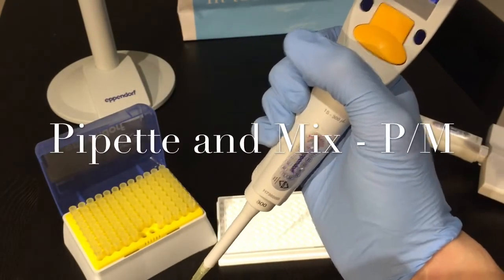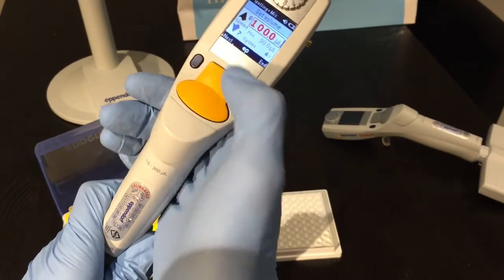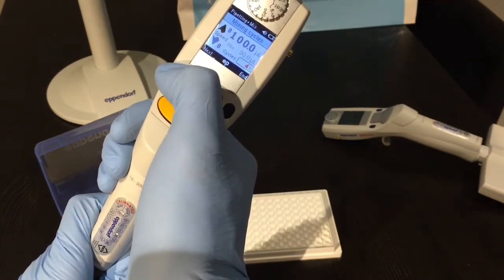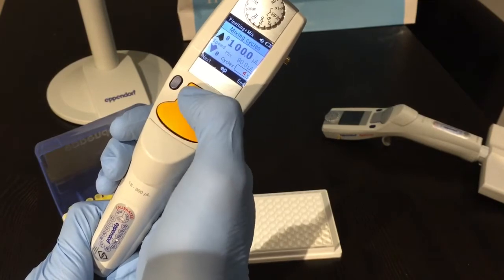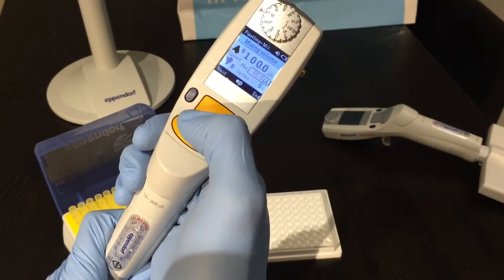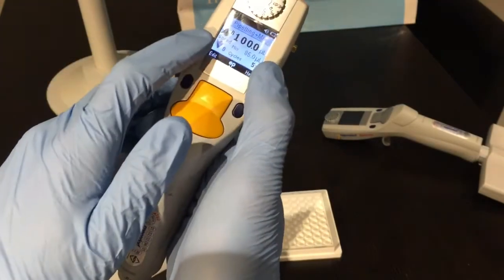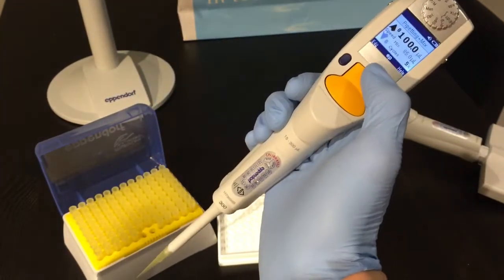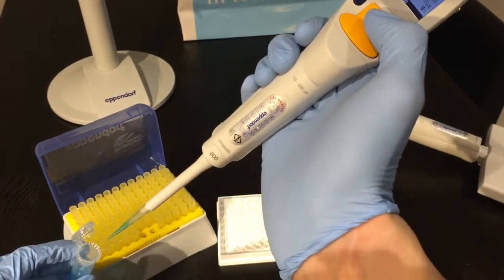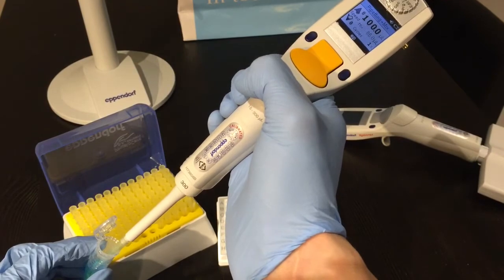The next mode is pipette and mix, P/M. This adds two extra parameters. Press edit and leave it at 100 microliters, aspiration speed at eight. Then the number of cycles is for your mix — let's do five cycles with a mix volume of 85 microliters. Press end when ready. The up arrow is highlighted, so I draw my liquid up, and when I dispense by pressing down it performs the mix cycles automatically.